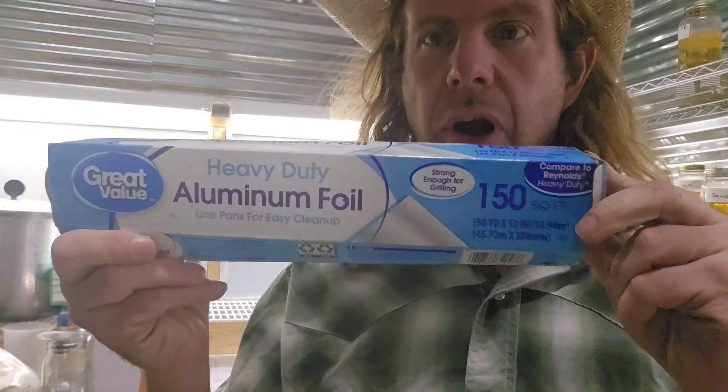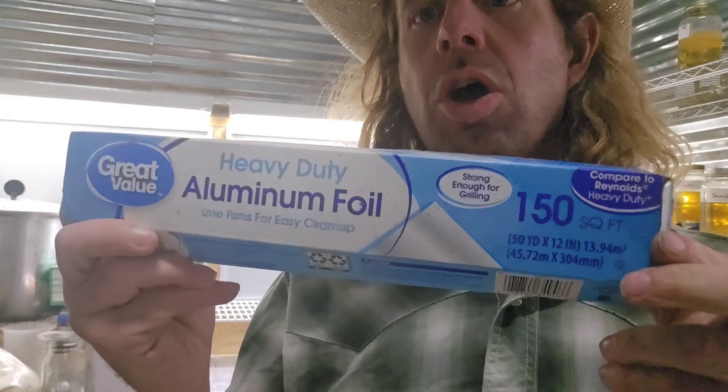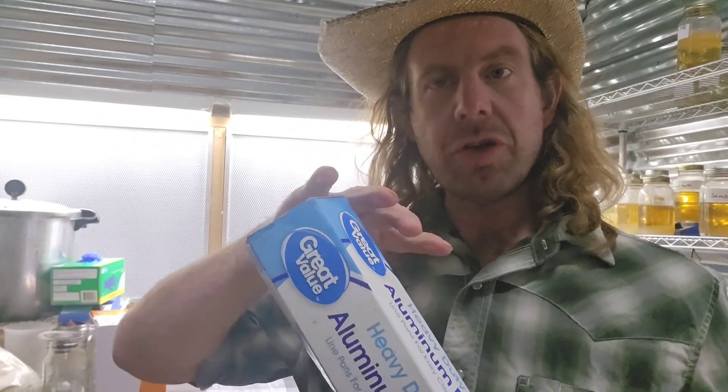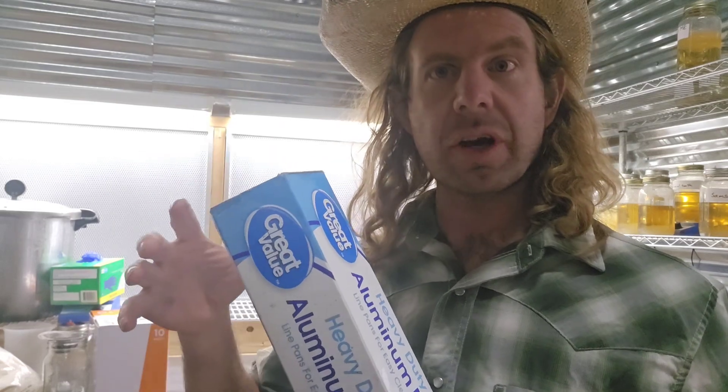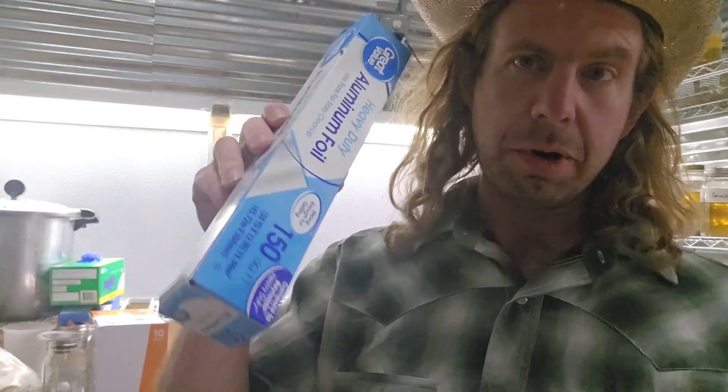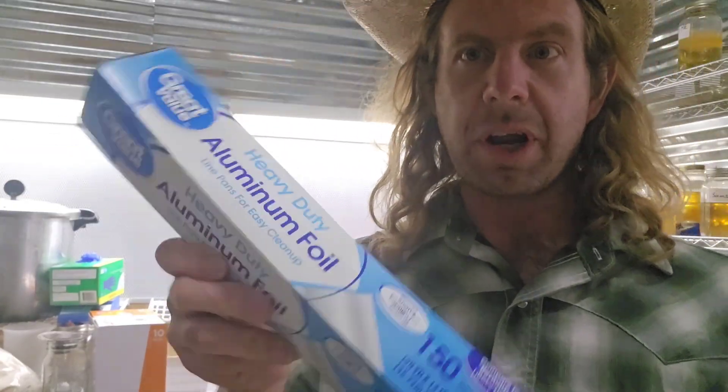Number eighteen: aluminum foil — I recommend the heavy duty. You're going to use this to wrap up tools when you're pressure cooking them, to cover the lids of jars so you don't get excessive moisture in there if you're using polyfill filter or anything like that. Sometimes I just cover up some jars if I want to sterilize a few jars in my pressure cooker. Aluminum foil is a great tool to have on your farm — number eighteen.